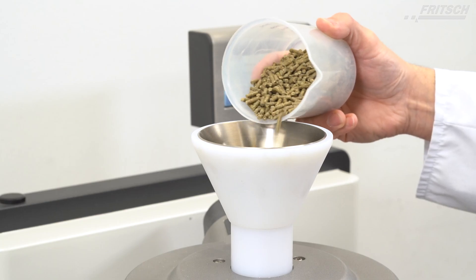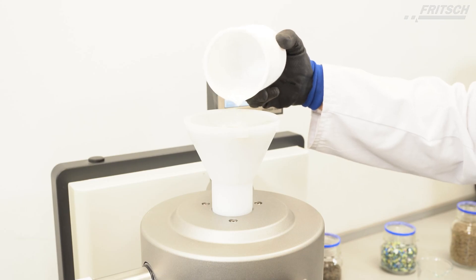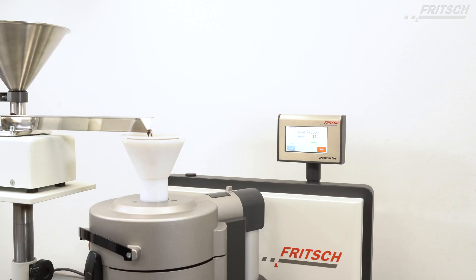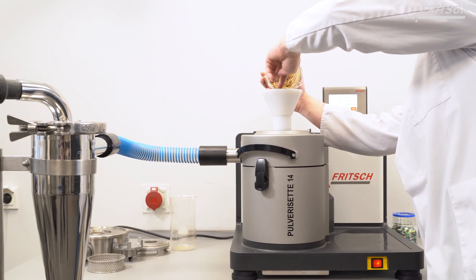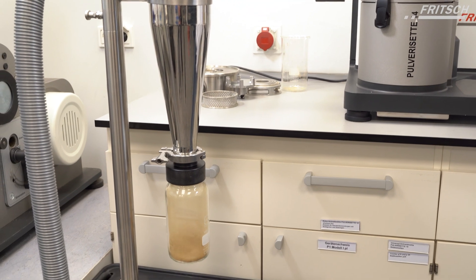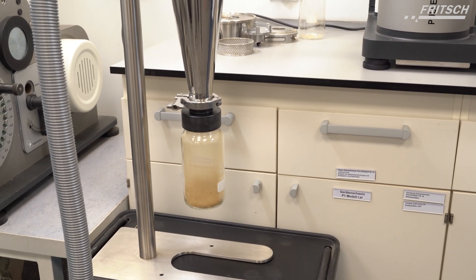Its powerful motor is ideal for the particularly fast comminution of soft to medium hard, brittle as well as fibrous materials and temperature sensitive samples, with an extremely fast sample throughput which can be further increased by the use of the Fritsch Cyclone separators.